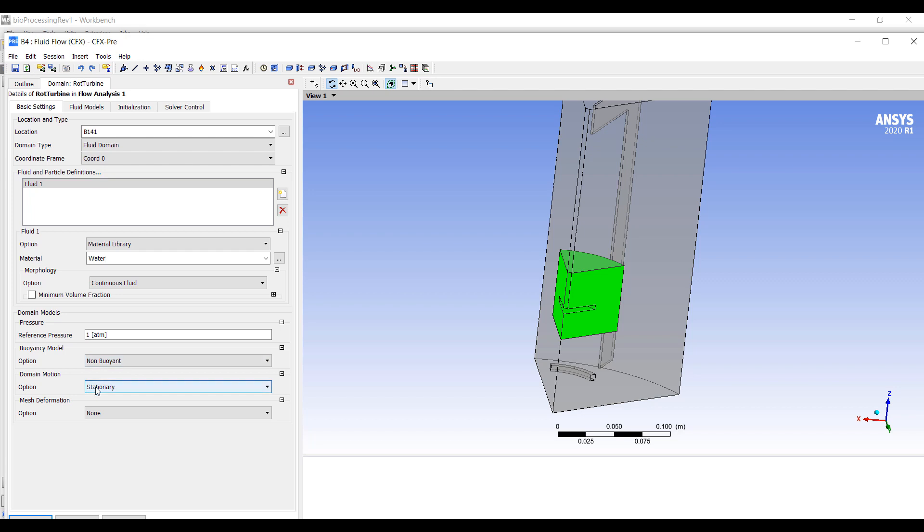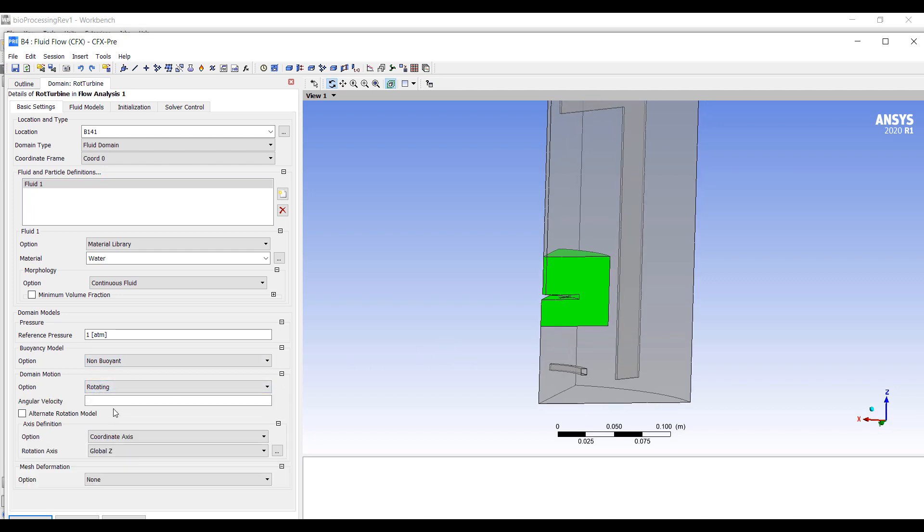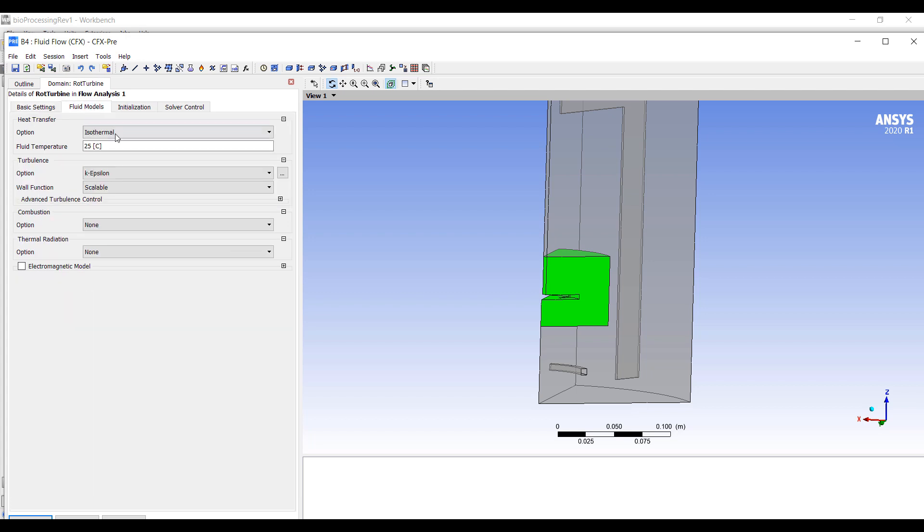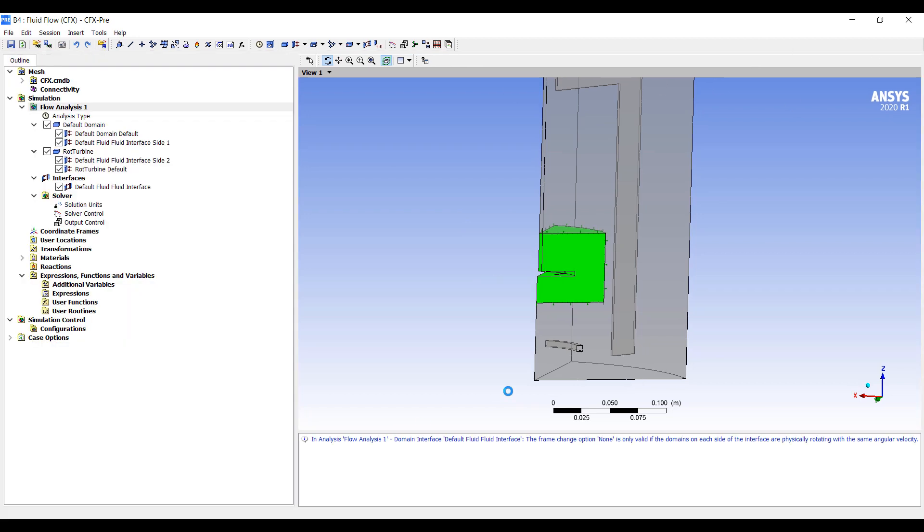We're going to turn off buoyancy for now. And it will be rotating at 340 RPM around the Z axis. We can select different turbulence models. The mesh is pretty coarse here, so I'm not going to bother with more advanced turbulence models. We'll stick with a K-Epsilon model.